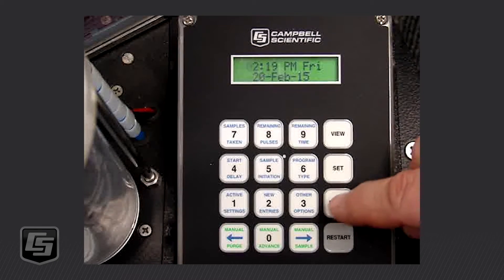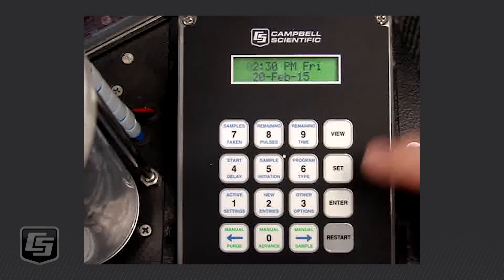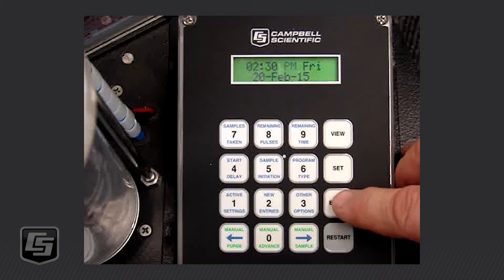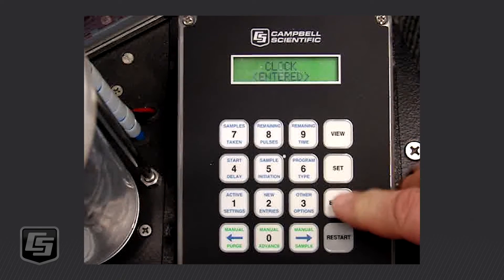If it doesn't match, go ahead and adjust it. Let's say it's 2:30 — I'm going to change that to 0230 and then press Enter to get to the PM/AM field. If yours is showing AM instead, we're going to change that from AM to PM. If the day is not correct, press Enter again, select the correct day, and press Enter until it's flashing for each of the different settings.